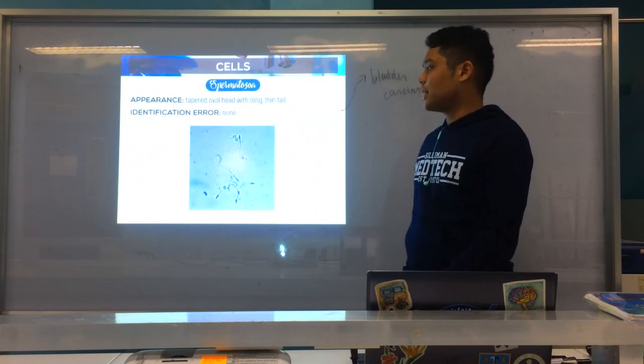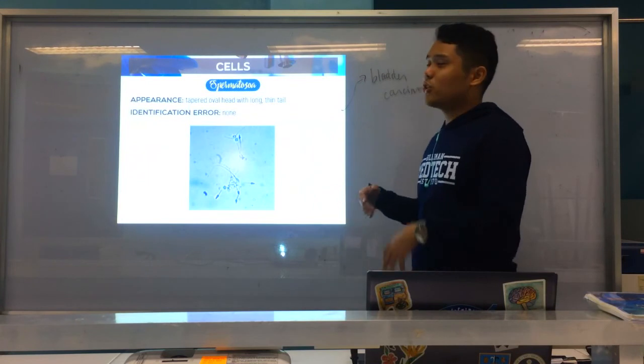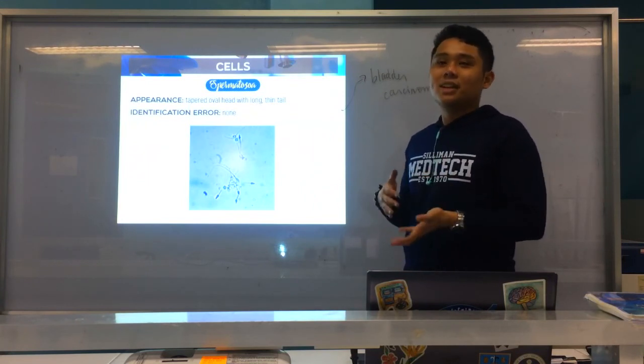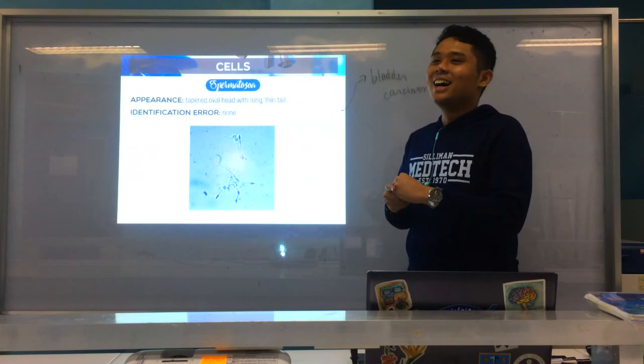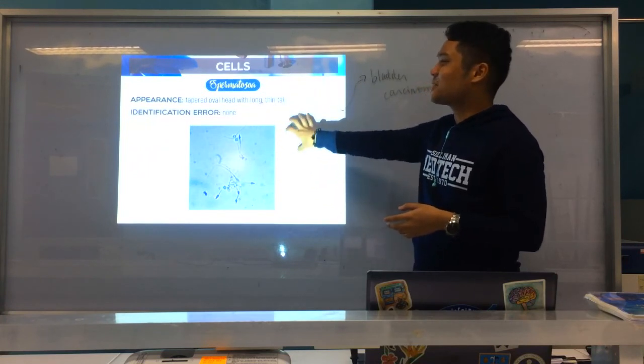Usually wala siya identification error, wala po siya clinical significance. Spermatozoa. It could just indicate na the patient gikan na siyang nakig intercourse or nag self-love, okay? Or unsa pa man, or yeah. So sana all na ay charot lang, okay. All right. So again, that's for spermatozoa.